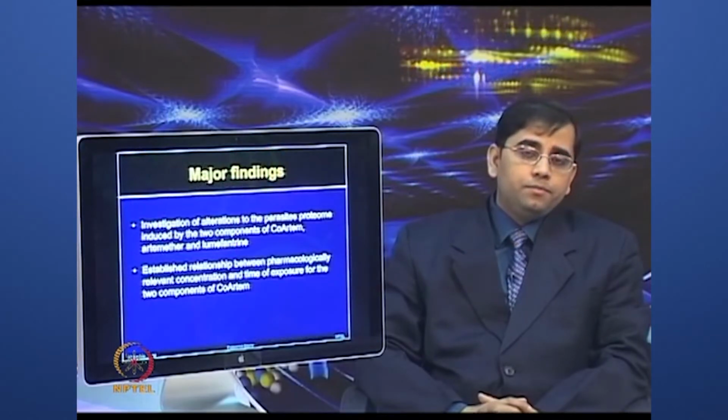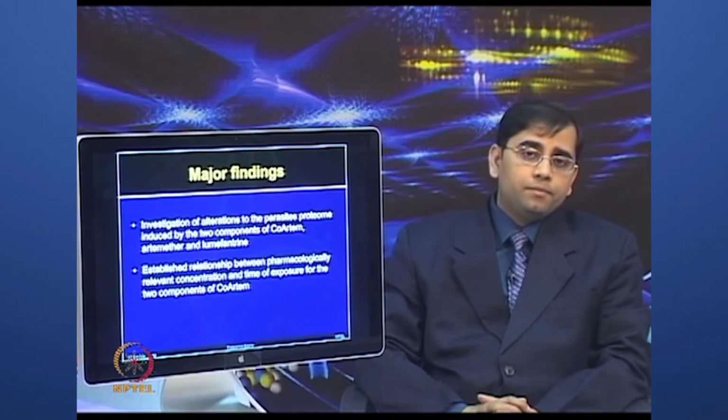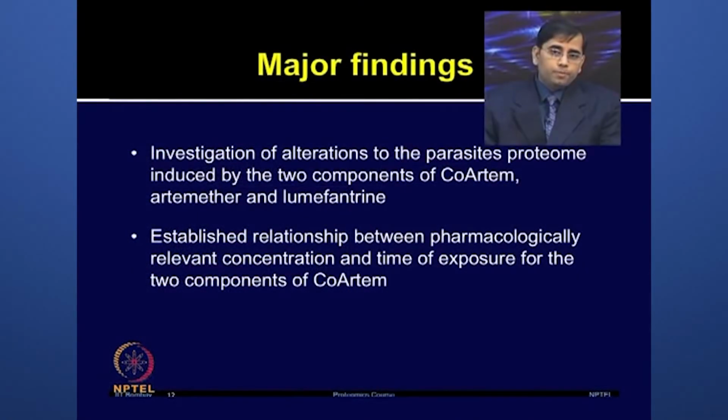So, from this study, the major findings were that authors successfully investigated alterations of parasite proteome induced by two components of Coartem, artemether and lumefantrine. By using proteomic approach, they investigated specific and non-specific effects of two antimalarial drugs in pharmacologically relevant conditions.